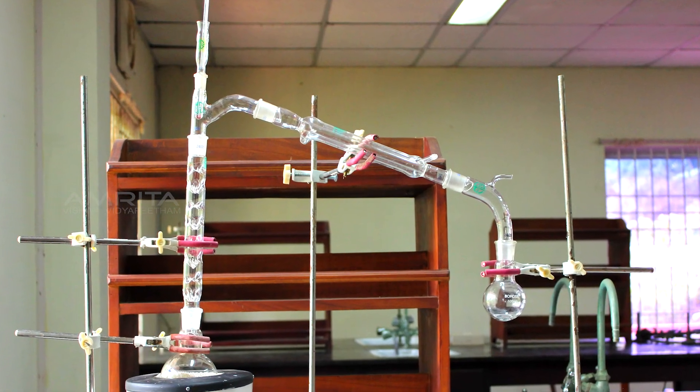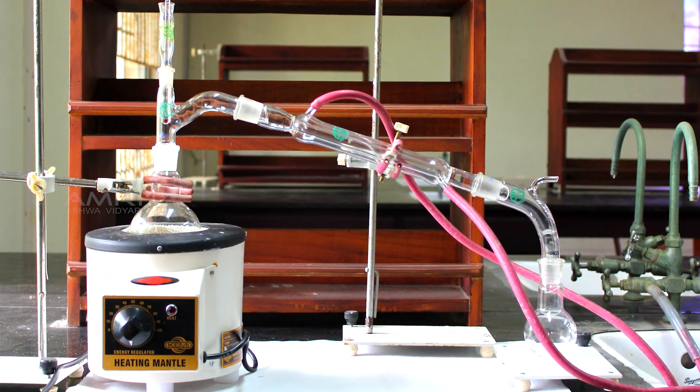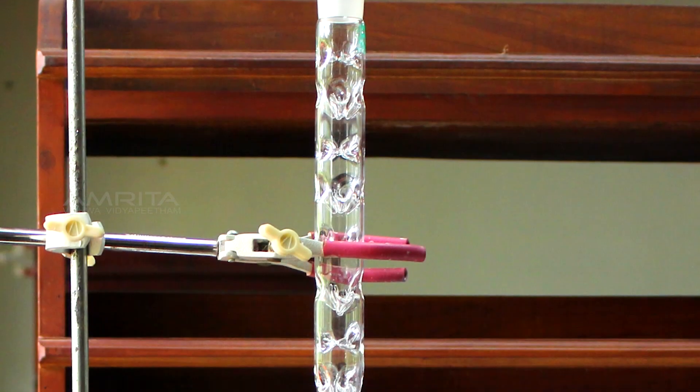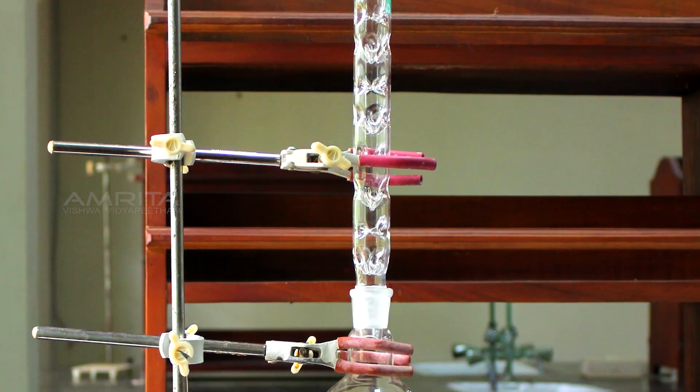The apparatus for fractional distillation is similar to that of simple distillation except that a fractionating column is fitted in between the distilling head and the RB flasks.